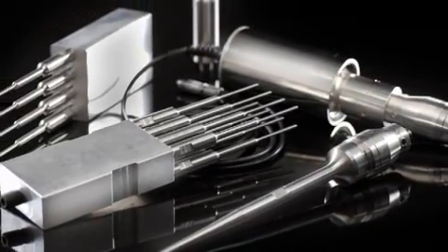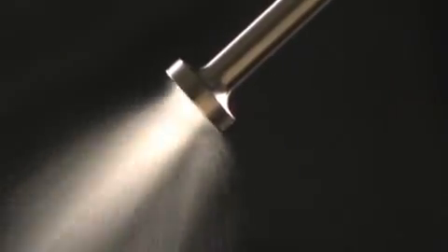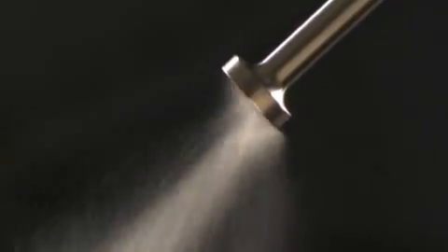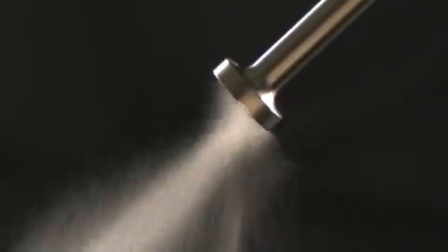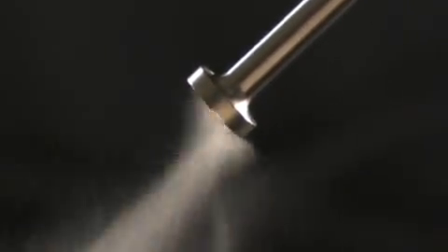Unlike conventional spray nozzles that rely on high-velocity pressure to shear a fluid into small drops, the ultrasonic atomizer uses vibrational energy to generate a low-velocity mist.